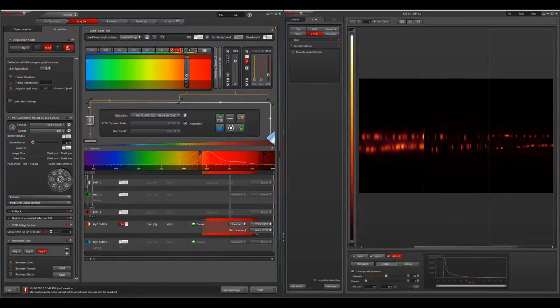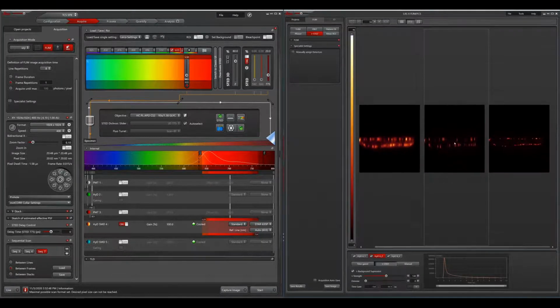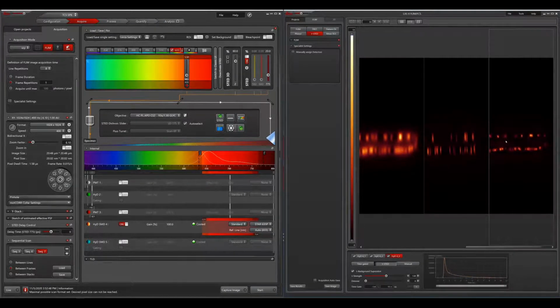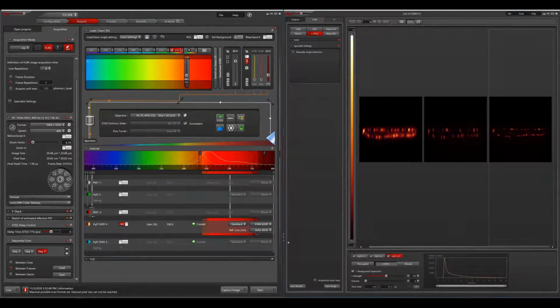All right, so now it's finished. This is our data. Left side, pure confocal. In the middle, we have only XY resolution improvement, which gives me this famous pencil shape here. And on the right-hand side, we have now also a Z resolution plus an XY resolution improvement. So this nicely demonstrates, I think, the potential of Tau-STED for your fixed specimen.